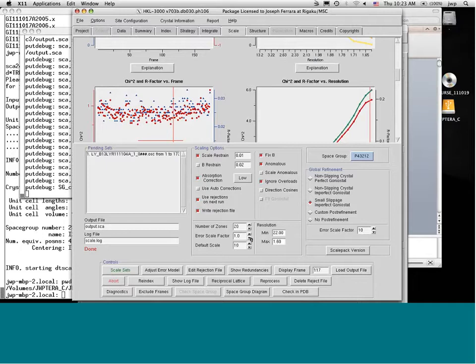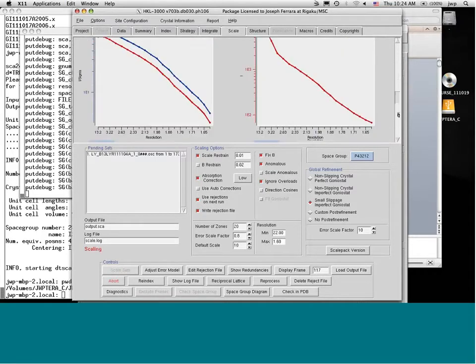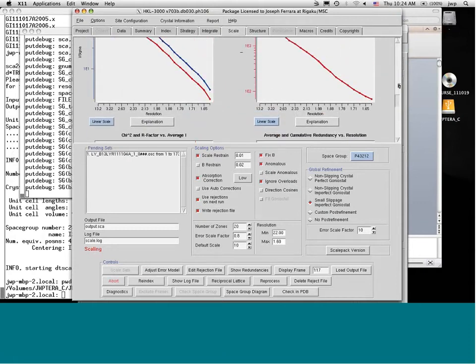So what can I do here? One is too high, and I think, well, maybe I did it wrong. Did I go the wrong way? Let's try 0.8. The interface is quick enough and the program is quick enough that you can do a lot of stuff by trial and error.